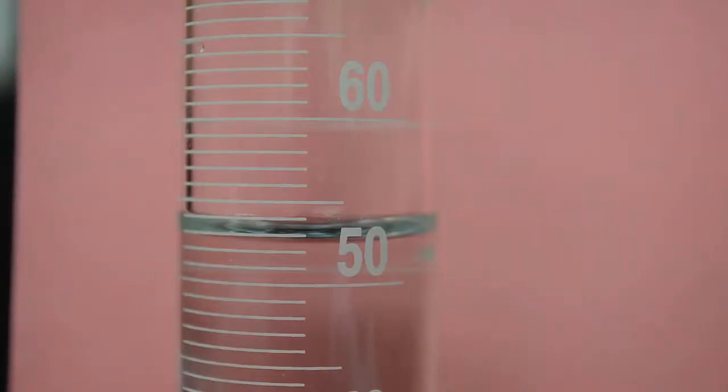Okay, so I would read this—well, it's between 50 and 60, so the first number would be 5 in the tens place. And then I would count up: 51, 52. It's between 52 and 53, so that would be the second number, 52 mL.